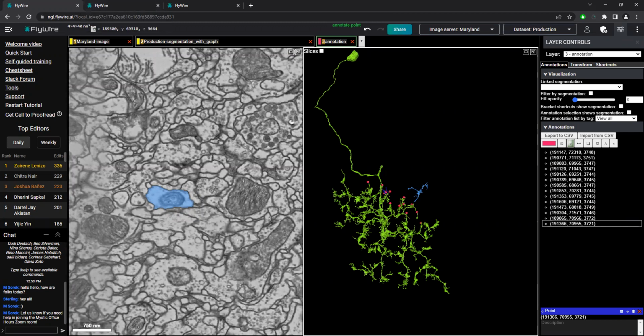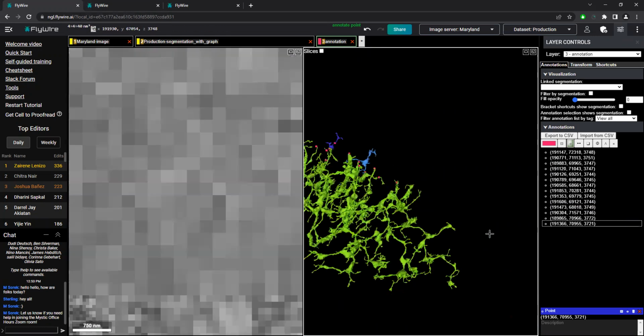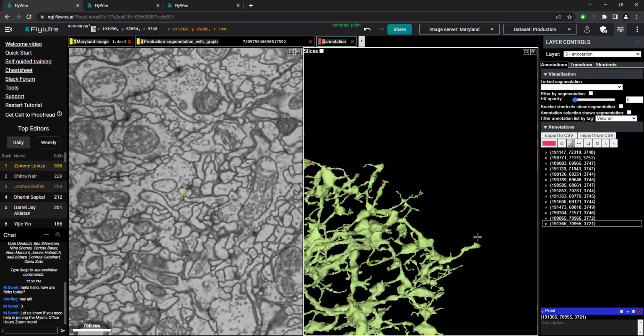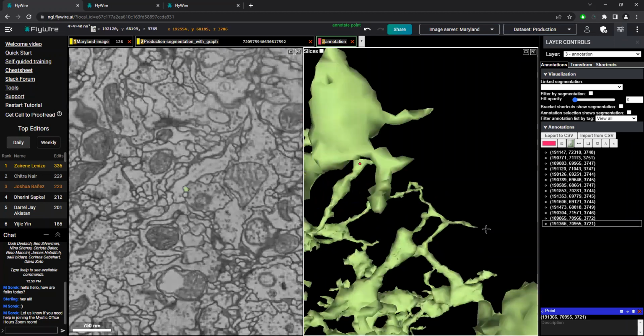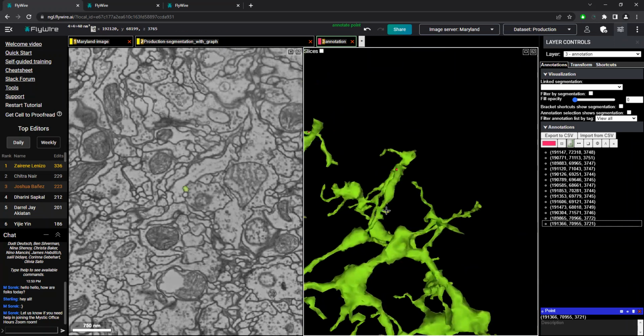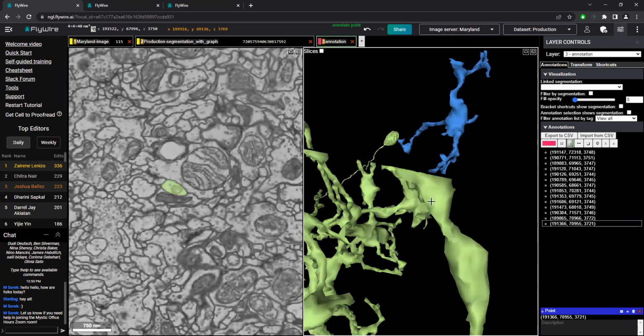That's pretty much what I do myself. I spot check it, and a lot of times I'm just looking to see, is it a long skinny one, then I should look at the end of it probably. If it's a short skinny one like this one right here, I wouldn't look at the end of it, because it probably doesn't have anything more to add to it. If it's thick and short like this, definitely we would want to check the end of it.